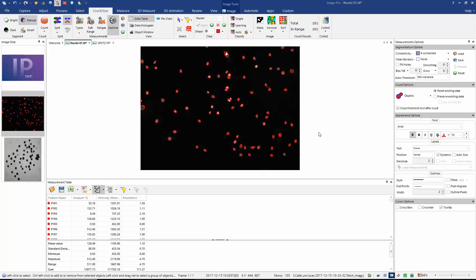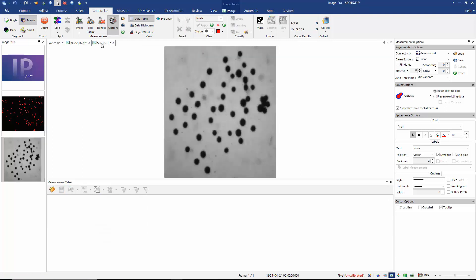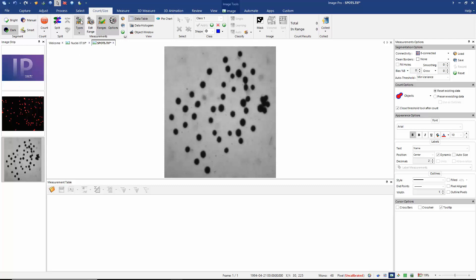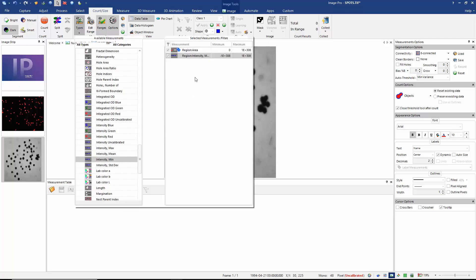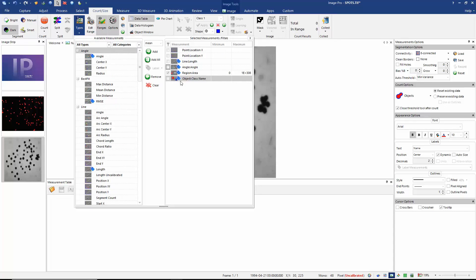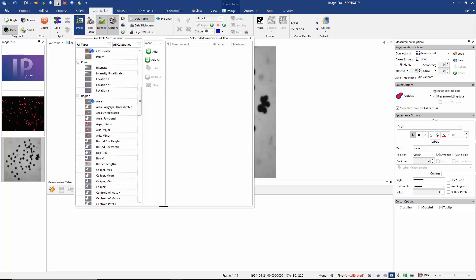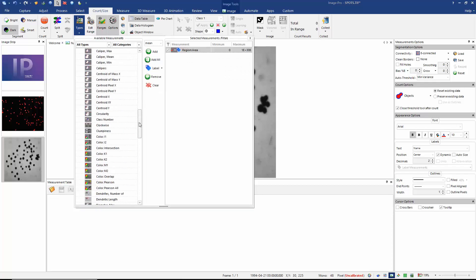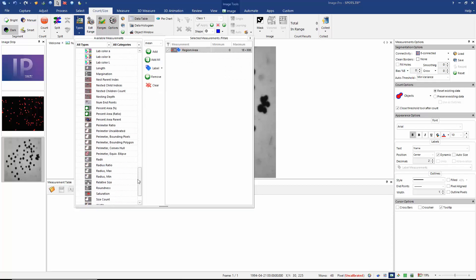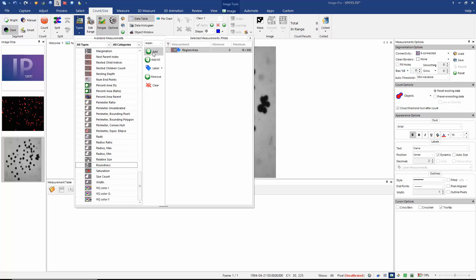Now I'm going to move on and measure the objects in my second image. In this case, the image is an 8-bit monochrome image, so it has pixels in the range of 0 to 255 grey levels. My objects are dark on a bright background in this case. Again, I'm going to start by resetting my measurements options with the green reset buttons. I'm now going to choose my measurement types.